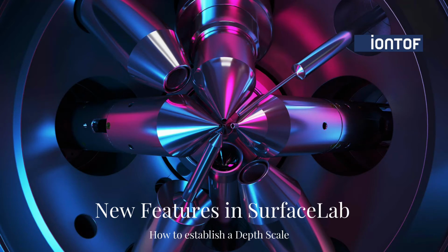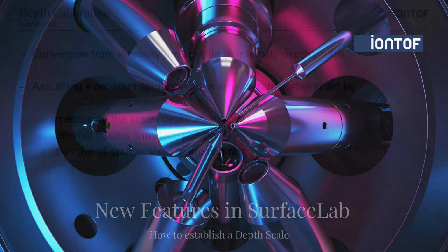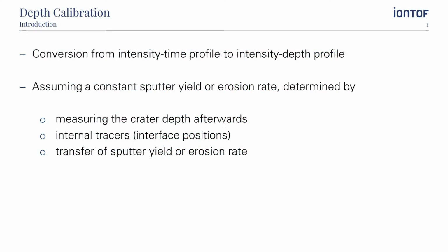My name is Julia and today I would like to show you how to establish a depth scale in SurfaceLab. A depth calibration in general is the conversion of an intensity time profile to an intensity depth profile. This is done by assuming a constant sputter yield or erosion rate determined by measuring the crater depth after the measurement, knowing the exact depth of internal tracers, or the transfer of a sputter yield from another dataset.